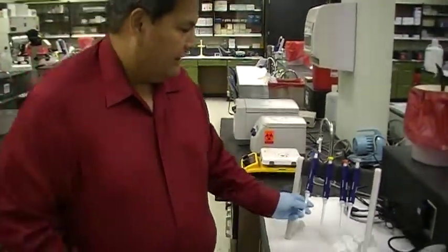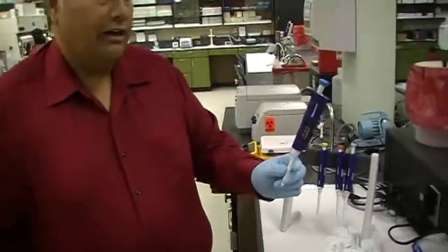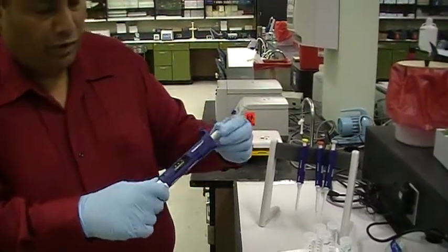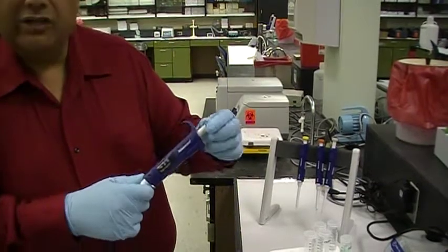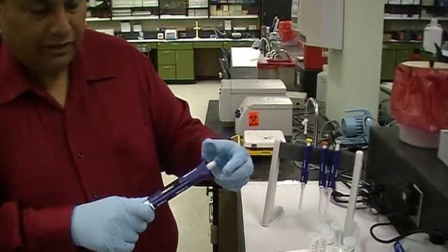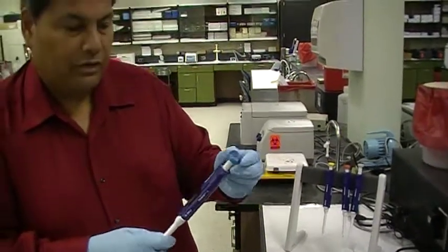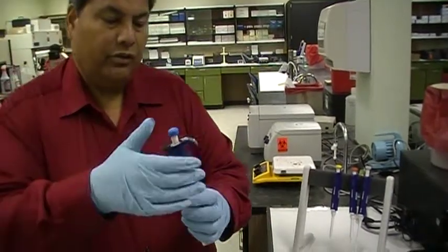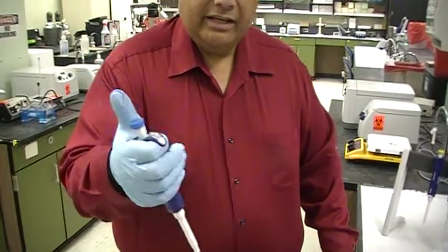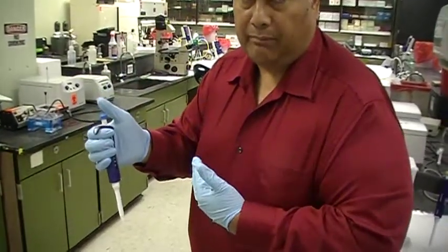There is a certain way that you need to treat these pipettes. To adjust the volume, we simply turn the top knob and watch the number within the window changing. Each one of these is in microliters. When you hold it, you're going to hold it in your right hand, with the window turning towards you so you can see the numbers.